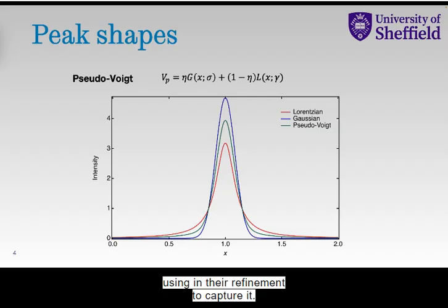And then generally what we'll do is a calibration, where we can use a known standard in order to work out what that peak shape should be and the ideal parameters that we need in order to describe the ideal peak shape produced by the instrument that we're using. So this peak shape is going to be controlled by our setup and by the instrument that we're using. So as I say, it's worth thinking about in a little detail and defining it at the beginning.